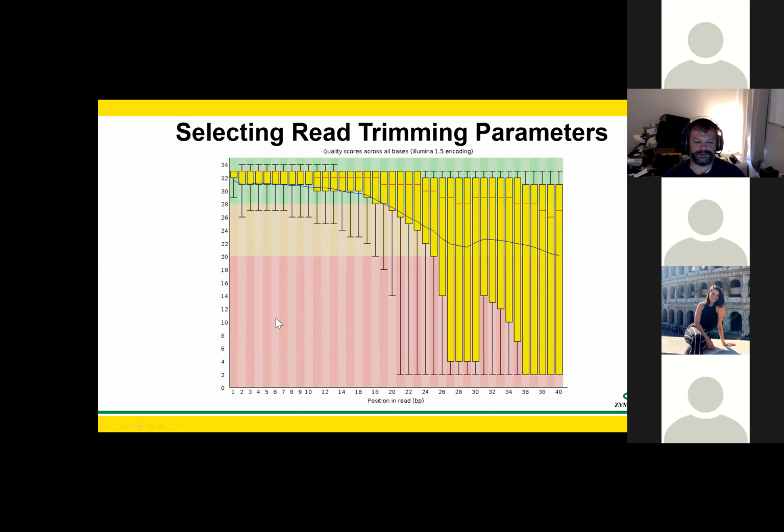So just as an example, if I'm looking at a position in the read and I have a quality score of 10, so in other words, 10% chance of error, then my expected error is 1/10 of an expected error. If I have 10 bases in a row where their average quality score is 10, then at that point I have one expected error. So I can say that in this group of 10 bases with an average quality score of 10, statistically speaking, I expect there to be one error in there.